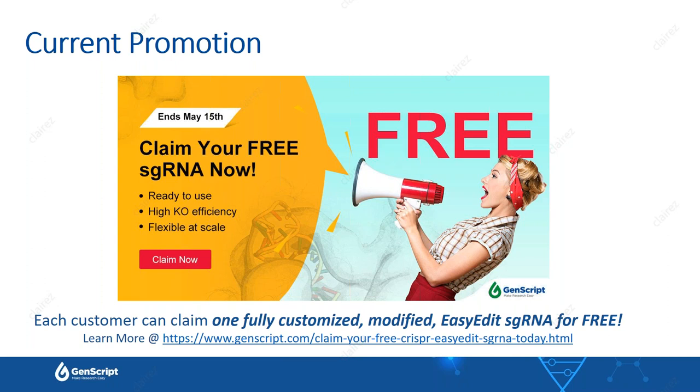Another question is, is the CRISPR guide RNA clone only optimized for the mammalian system? Has it been applied to gram-negative bacteria? It's definitely been used in other systems. It's definitely been used in bacteria as well. In terms of changing up the system, I'm not sure how you'd have to edit the actual system.